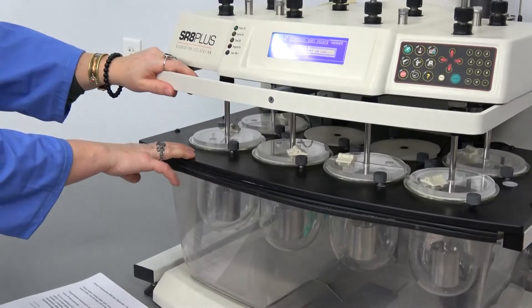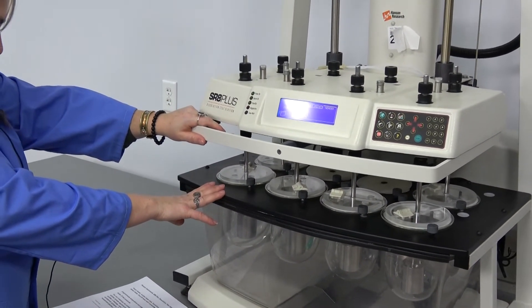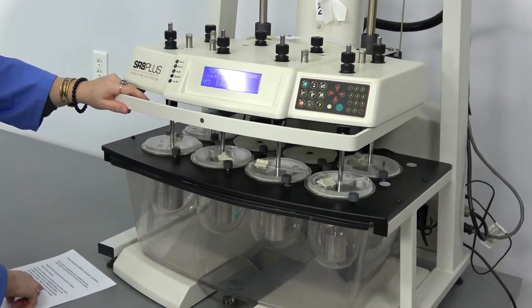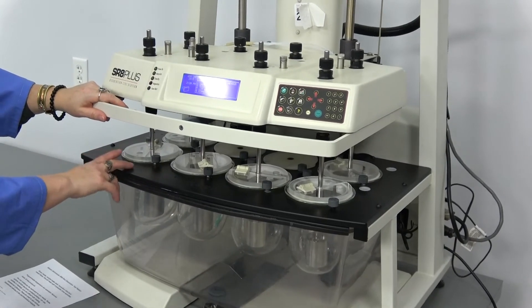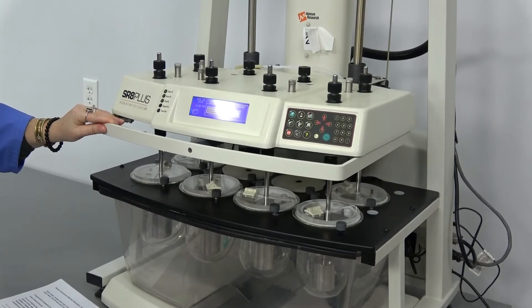Some options include electronic probes, e-probes that can be ordered from the manufacturer. You can use paddles or baskets. Ours come with the six motor heads and also the six reaction vessels.